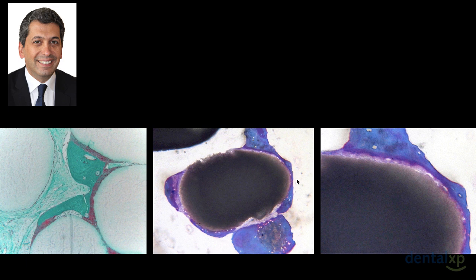And you see that in these cases, for instance, we had a very nice bone-to-particle contact, bone-to-graft contact. You can see here new bone formation and the contact of the graft. This is the bone, and in red we have the new bone, because whenever the graft was resorbing, new bone formation was taking its place and was forming around it.